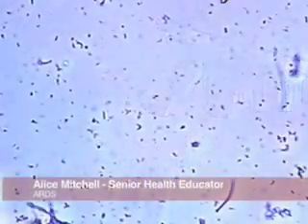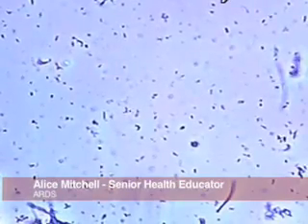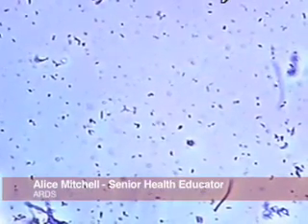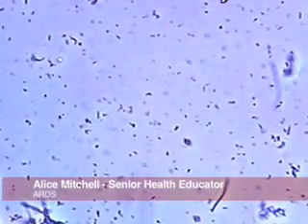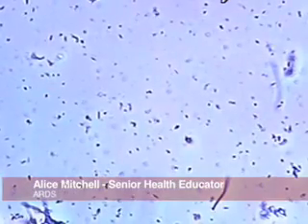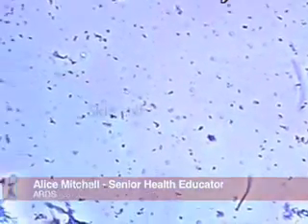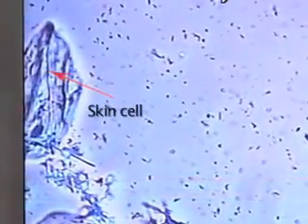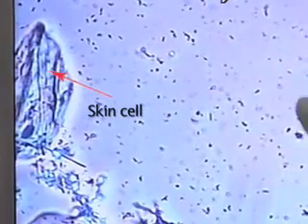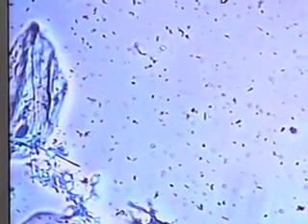So this sample of saliva — all these moving bodies that we see are bacteria, and these are skin cells from inside the mouth, but all these other moving small creatures are all bacteria.